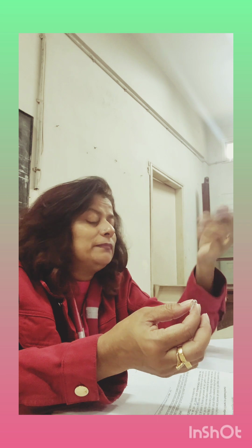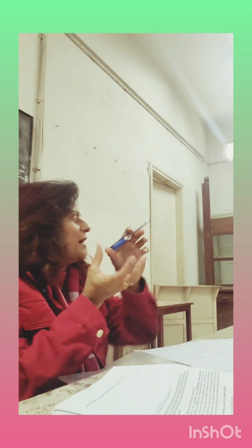Now what you are going to do? Read. Concentrate the solution on the Bunsen. Okay, now you have this 20 ml water. As it is 20 ml, you will measure it. You will put a measuring cylinder over a flat surface. As I've told you, never hold a measuring cylinder in your hand when you are measuring. I don't want to see anybody doing like that. Put the measuring cylinder over the plain surface, over your table desk, and then measure 20 ml of distilled water or any solvent you are using, whatever, XYZ.